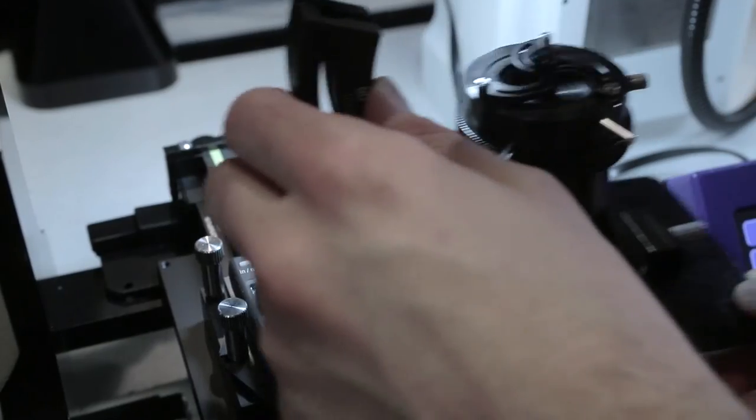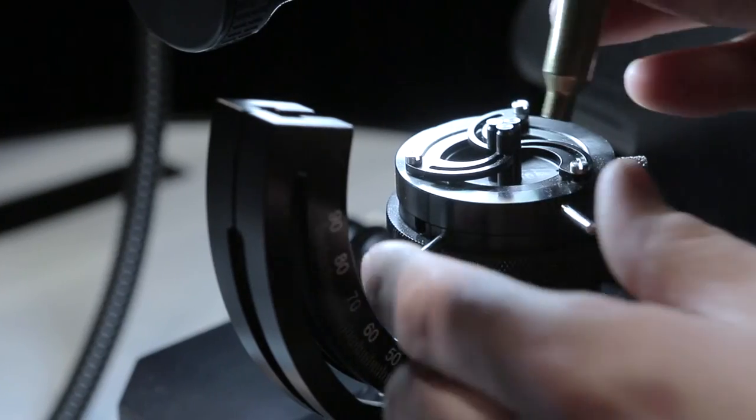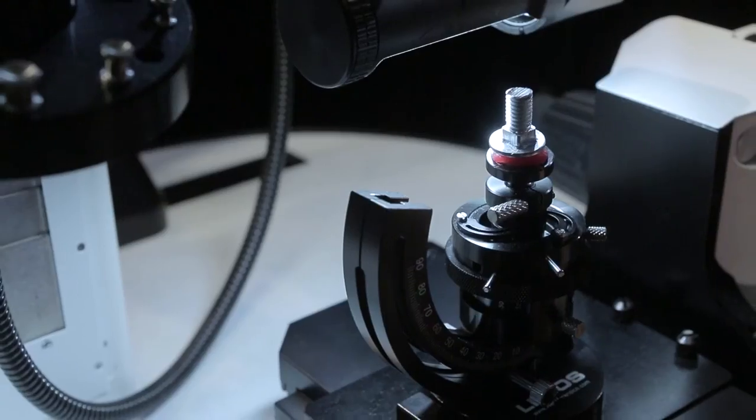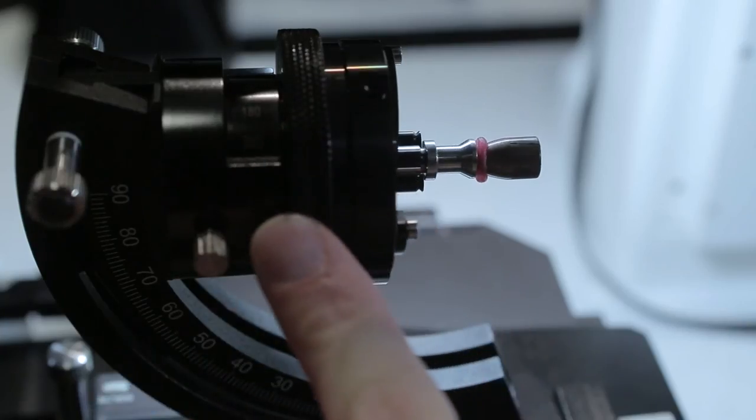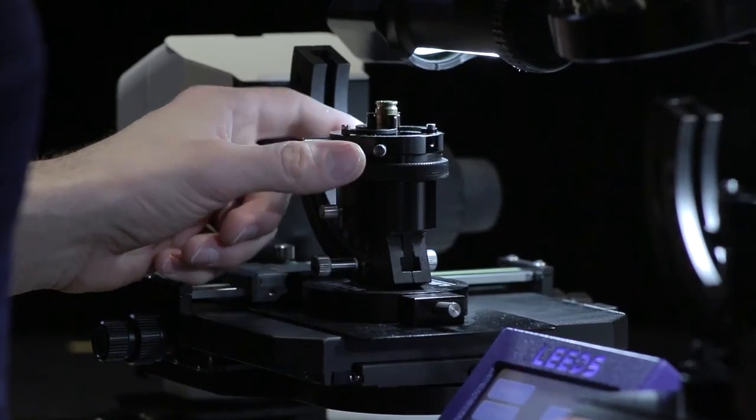The universal holder provides unique versatility and can hold samples as small as a 30-thousandths inch wire up to a 10-gauge shot shell without the use of any additional attachments.